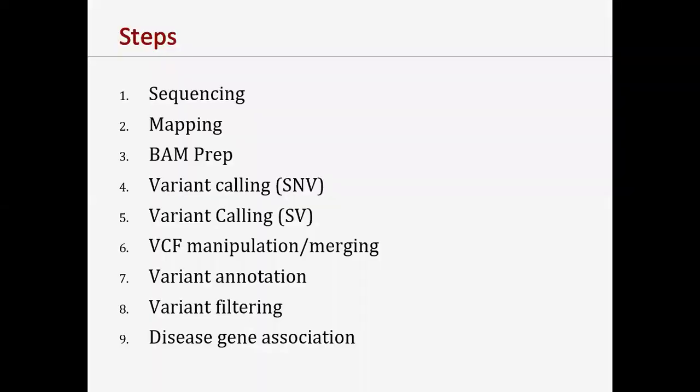Excuse me, ma'am. Yes. Ma'am, sometimes if our sample is for research purposes, then non-coding regions are also involved. So is it possible to identify the non-coding region variation? Yes, but those pipelines are different for non-coding variant calling.